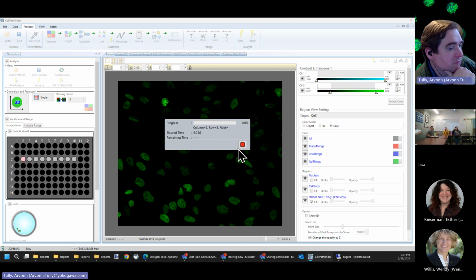and it will just run that protocol with all of those settings. Everything is saved, and you walk away, and you're good to go, right?